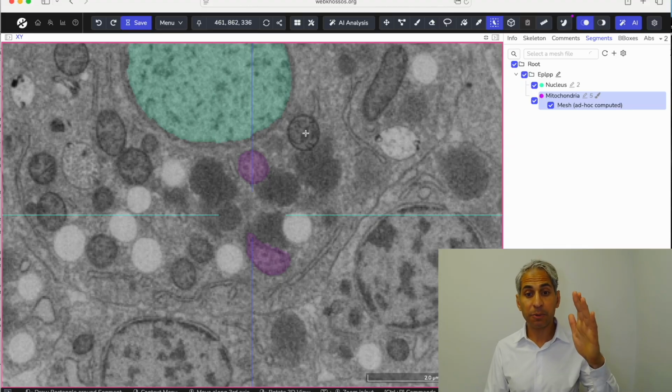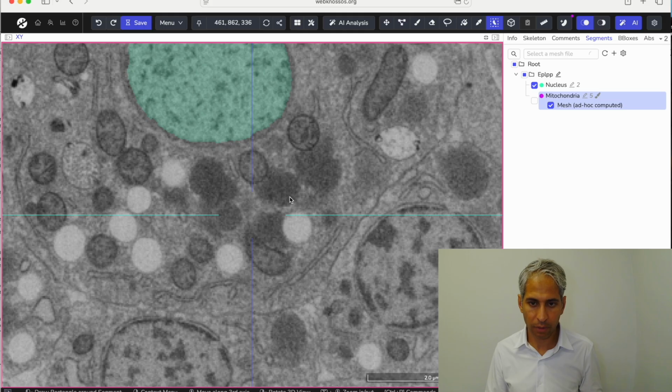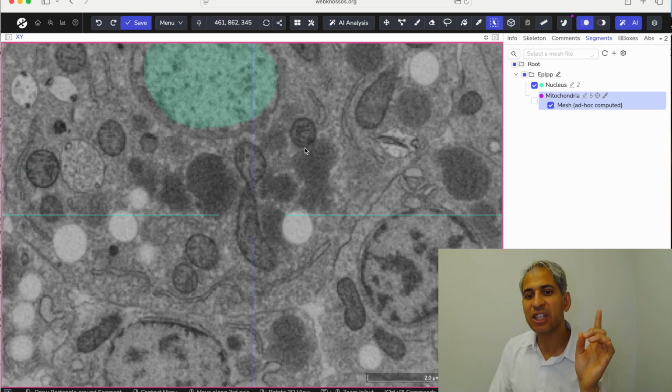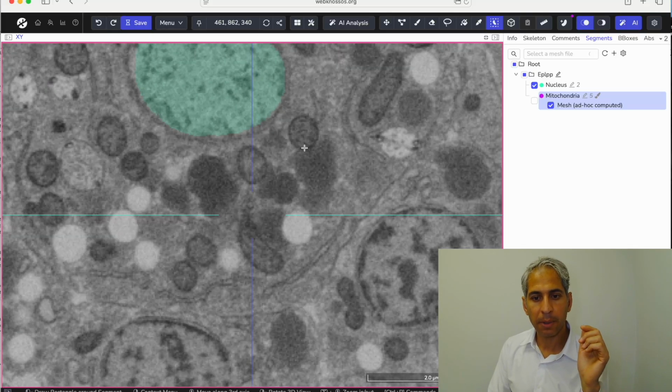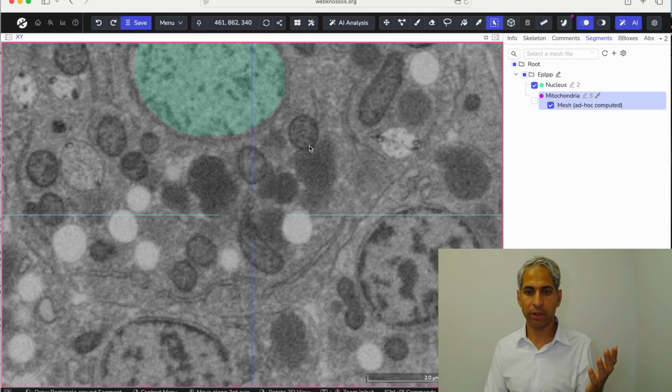So here I just made a deduction. I was confident that this is a mitochondria. Internally, these two look alike. They have the same darkness of outer membrane, and also the different shades of gray in the form of lines or lamella on the inside. True, this is spherical, not noodly, but based on what I've seen in the first mitochondria, I can say this is a spherical mitochondrion.